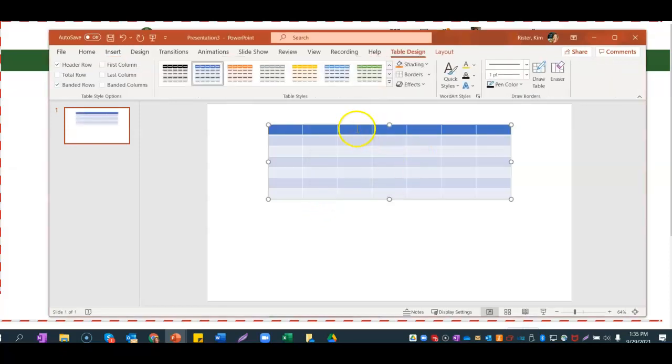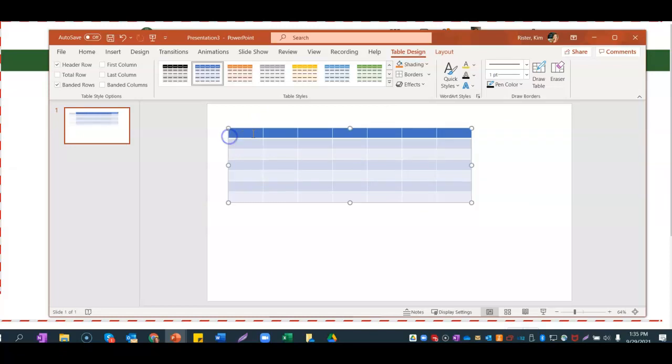All right, so now we have a table and it's editable. We can make these bigger if we need to. It'll let us spread them out however we need to adjust. Sometimes you have to play with it a little bit. But up here, this would be the substance. This is going to be the mass. Oops, typo there.